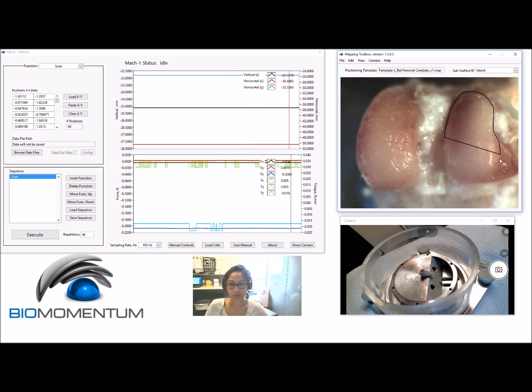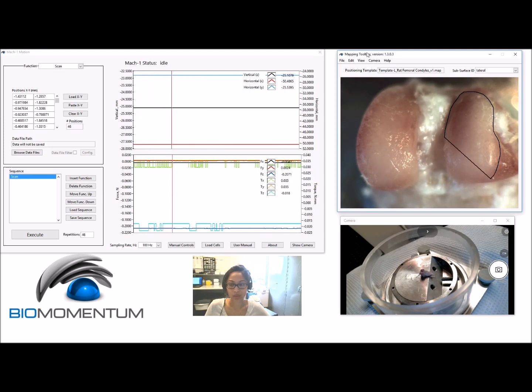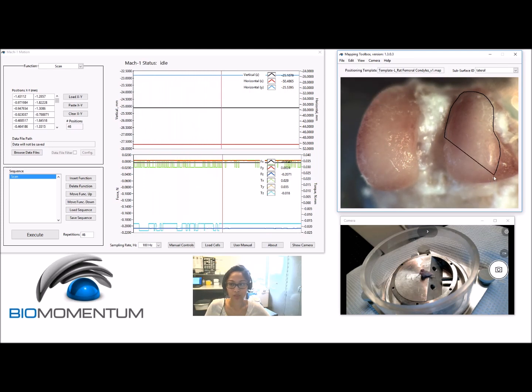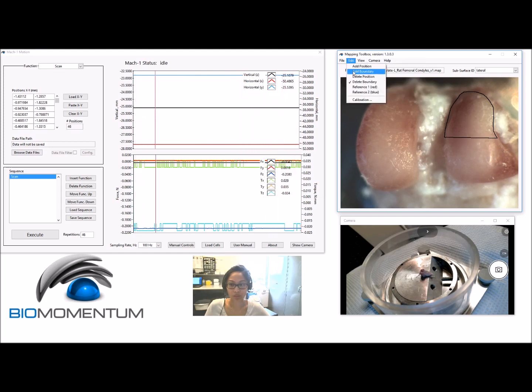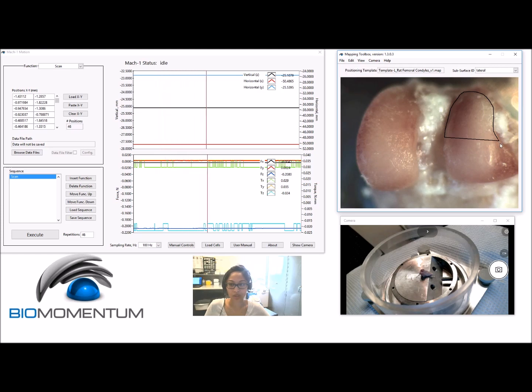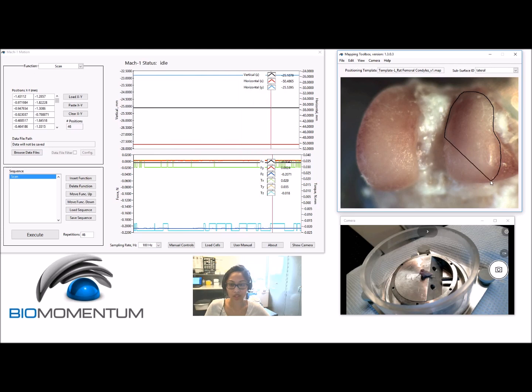If necessary, choose Delete Boundary and click in the camera feed at a boundary point along the sample subsurface, and the closed contour will be reshaped consequently. Then choose Add Boundary to continue creating the boundary of the sample subsurface.